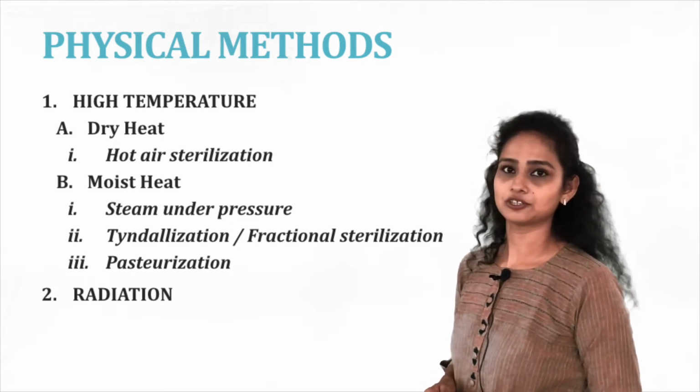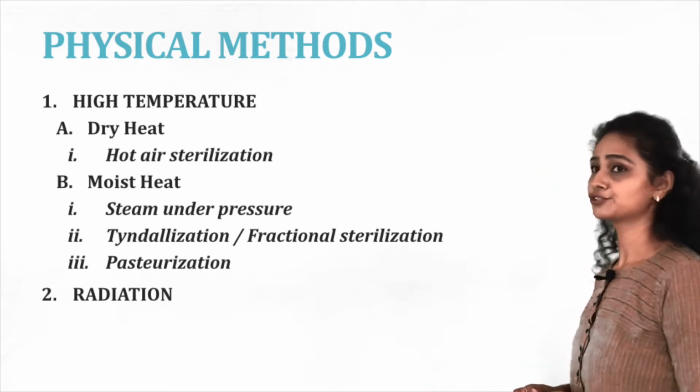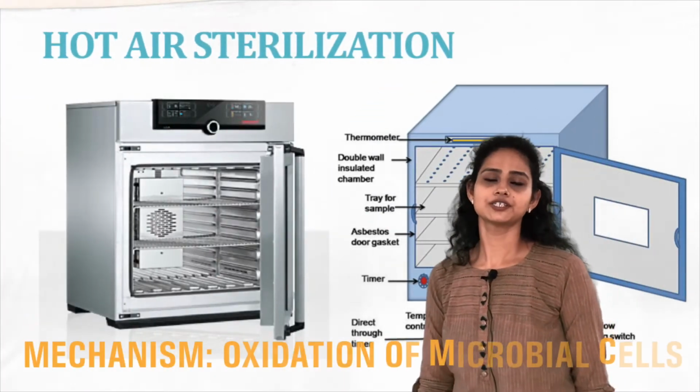And the next method which we are going to learn today is radiation sterilization. Okay, so in today's session, we are going to cover this many different methods. Let's start with the first, hot air sterilization.